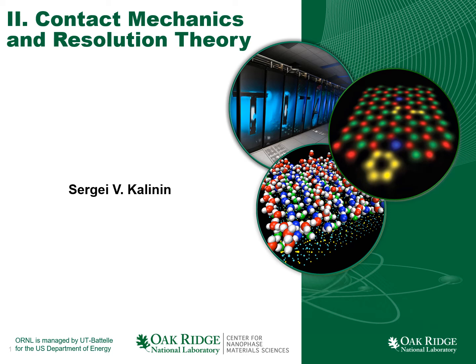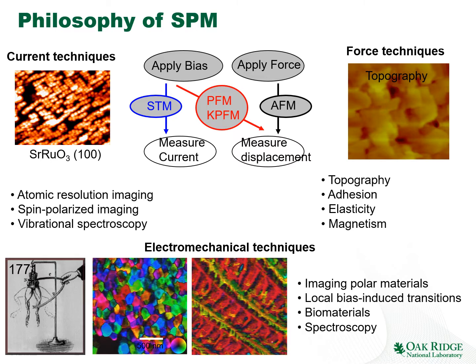In this second lecture on the PFM, we are going to explore the contact mechanics and the resolution theory in PFM. In other words, we are going to explore where the PFM signal comes from and with which spatial resolution we can hope to observe the nanoscale details in ferroelectrics and other materials.